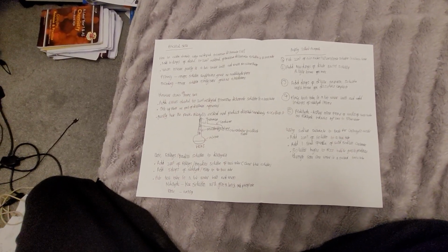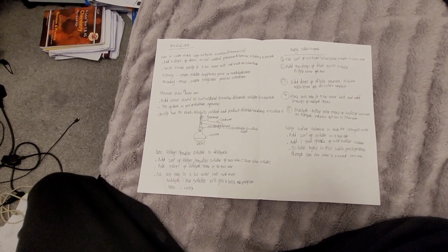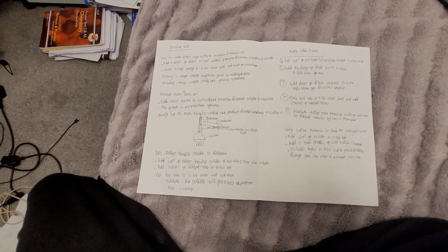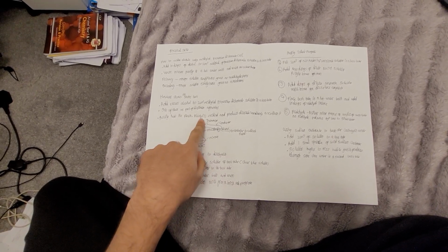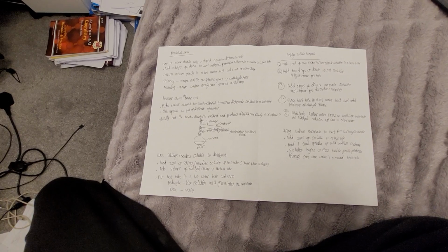Therefore, we're going to add excess alcohol to 2 cm³ of acidified potassium dichromate solution in a test tube. Set up the flask as part of a distillation apparatus. Gently heat the flask. The alcohol is oxidized and the product is distilled immediately so we can collect it. So here: heat, mixture, heat, fractionating column, thermometer, condenser, and this goes to your container to collect the liquid.